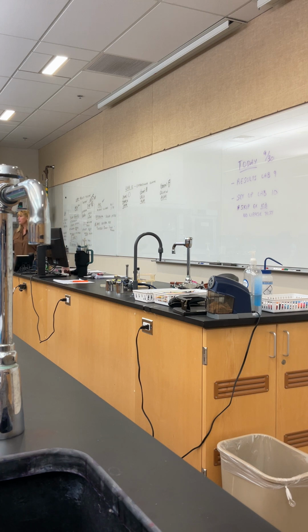How about Proteus? What color does Proteus have? Is it kind of yellowish, like a little bit clear? Yeah, kind of a clear color, right? It didn't really do a whole lot. Do you have your Proteus? Yeah, so this is Proteus. That's pretty good. Do you see how it's kind of yellowish? Not really very exciting, it actually kind of changed the media.